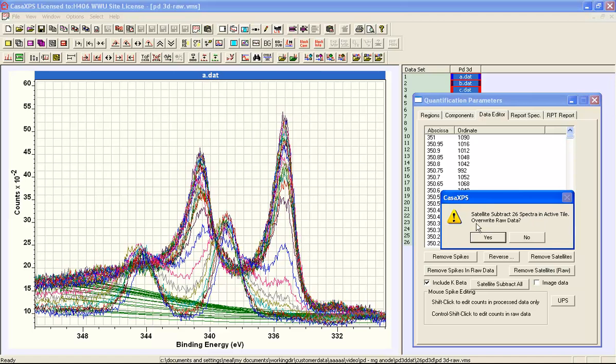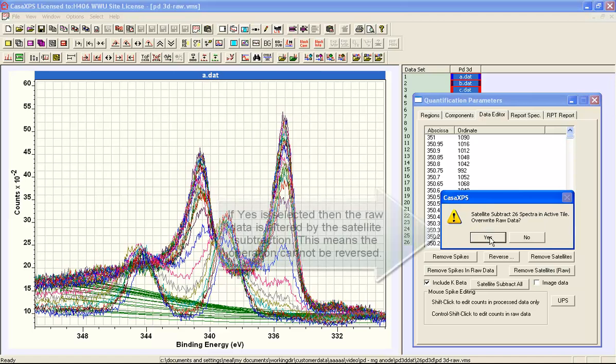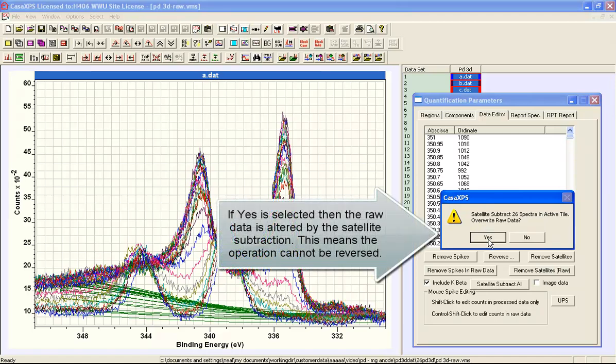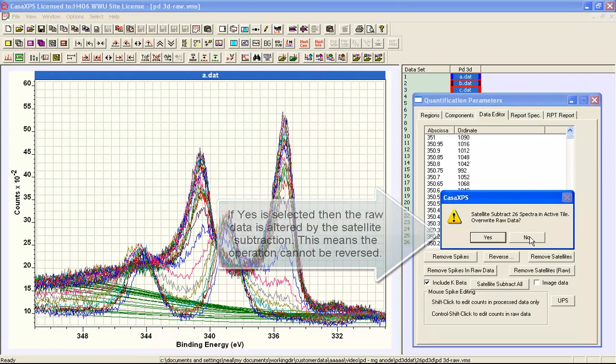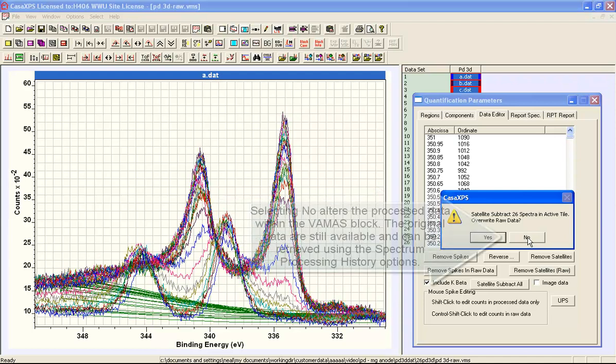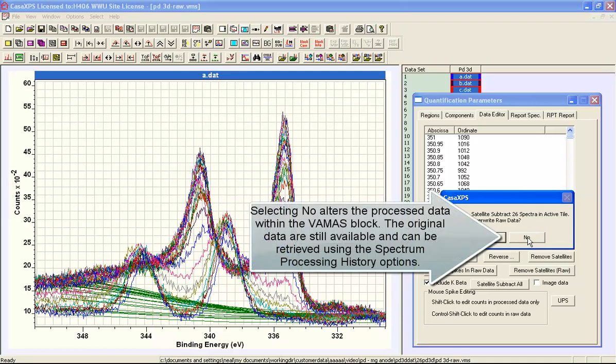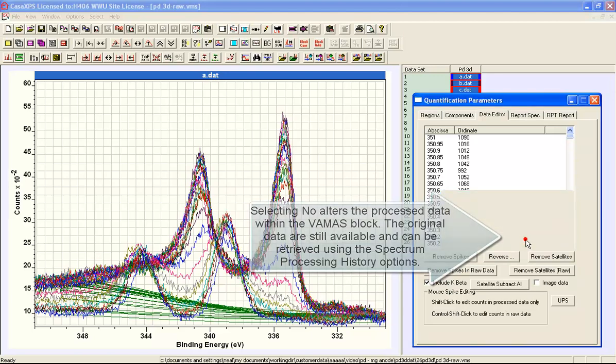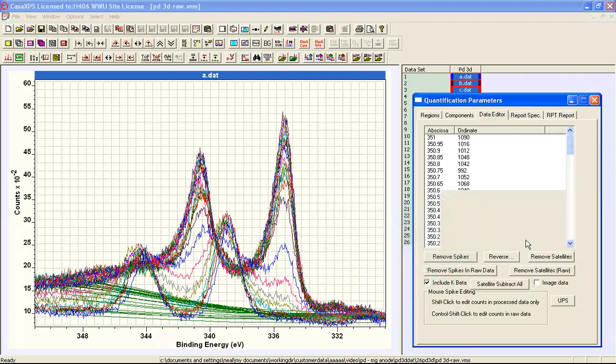And we have the choice of either doing the subtraction on the raw data so we can't undo it anymore or we can use no which will indicate that the processing will occur and the raw data will remain the same so I will use that option.